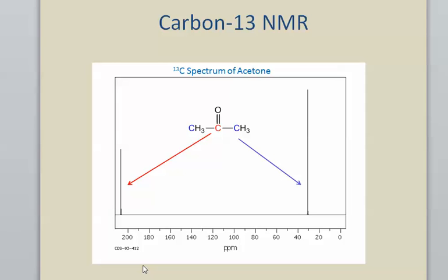So this tells us, when we see more than one signal, how many carbons, or at least how many non-equivalent carbons, you have in a molecule. And along with the hydrogen spectrum, this is another way to confirm a particular structure.